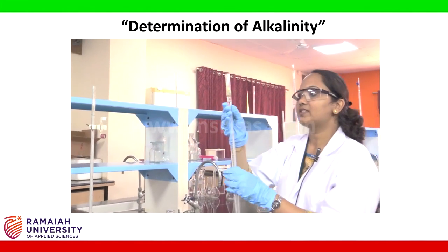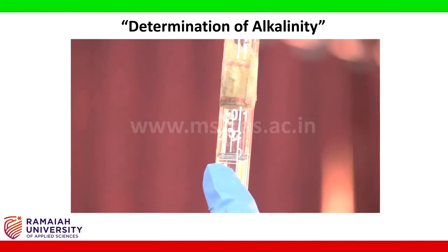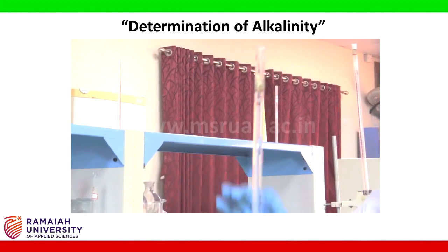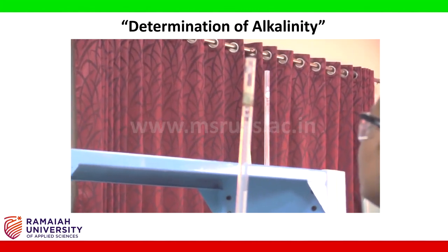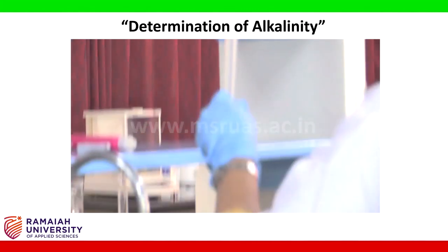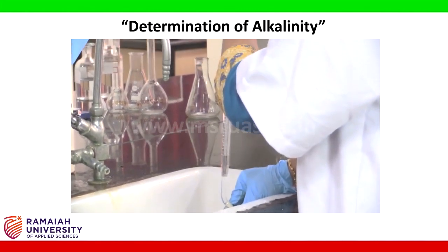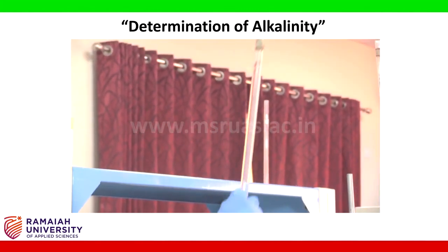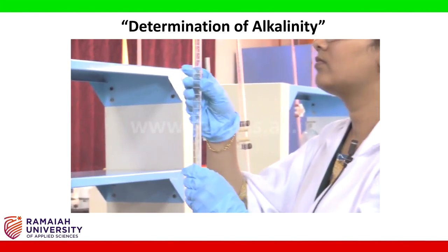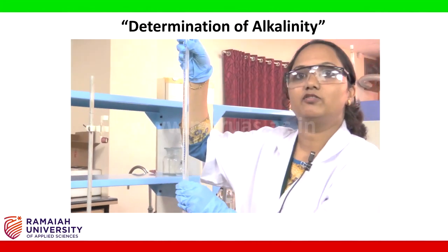So we need to adjust the sulfuric acid to this mark, that is to 0. So now the burette is filled with sulfuric acid.